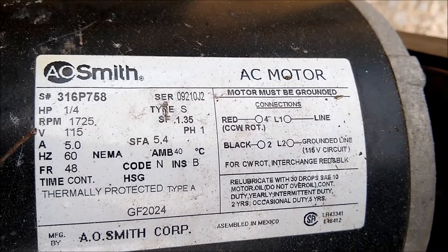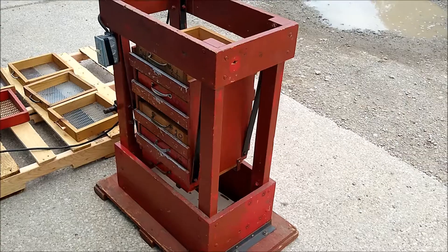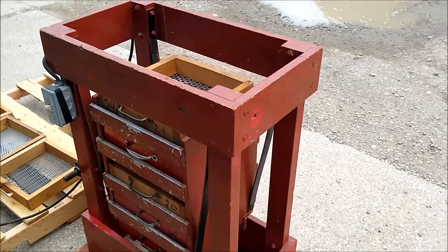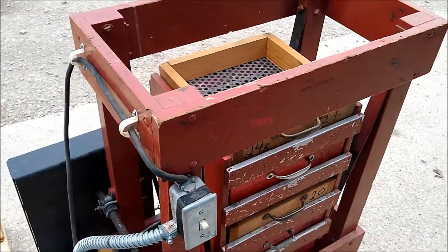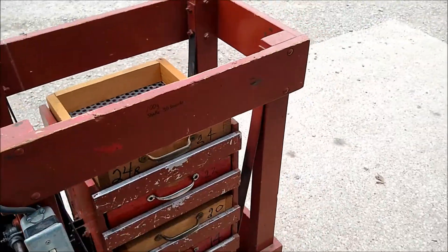It is equipped with a one-quarter horsepower, 115 volt single phase motor. Here we have the unit running. It is very quiet and smooth, and it shakes very well and nice.